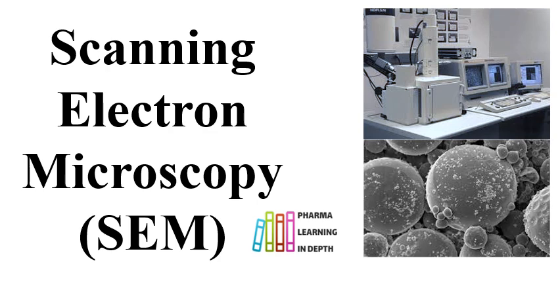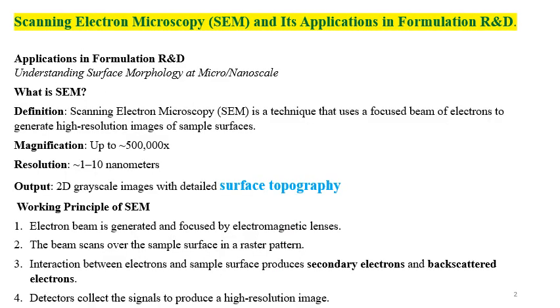Scanning electron microscopy is an advanced technique for the surface characterization or surface study, or you can say the physical study of the particles. These may be the APIs, drug products, and SEM involves study at the micro scale or nano scale for the surface morphology.